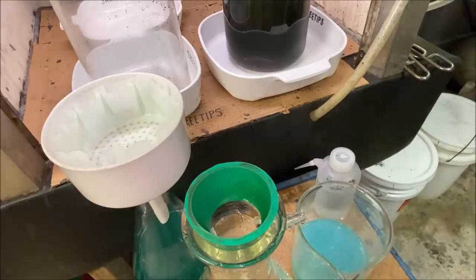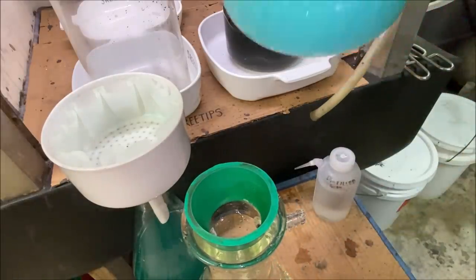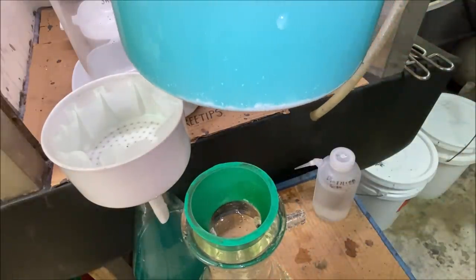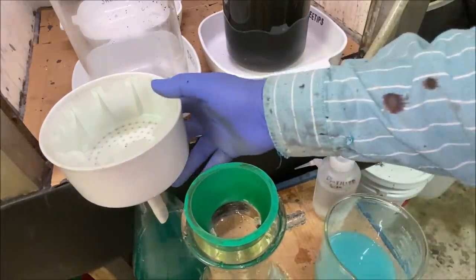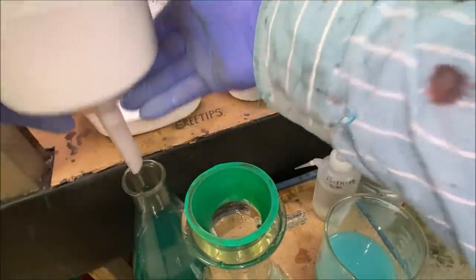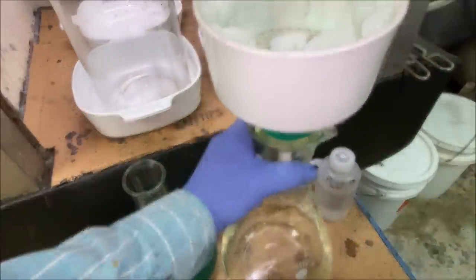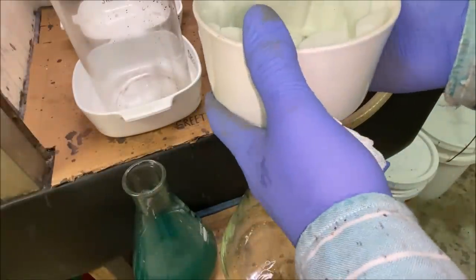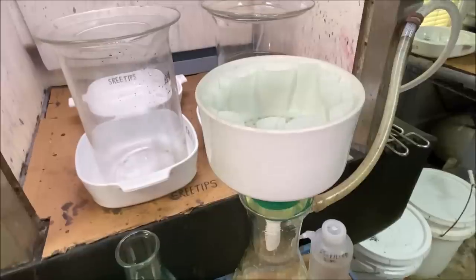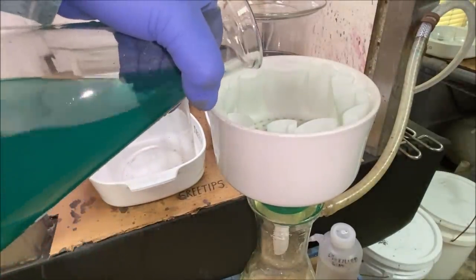Well, we did confirm the presence of silver in our solution, because I got some silver chloride down in the bottom. Not a whole lot, but a little bit. So we're going to have to pull all that off of there before we can start dissolving the gold with Aqua Regia. I'll go ahead and continue filtering our silver solution here.